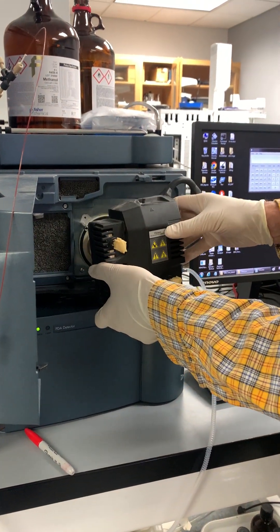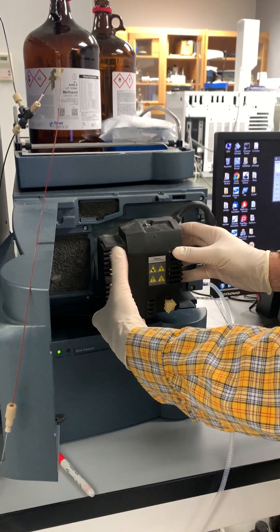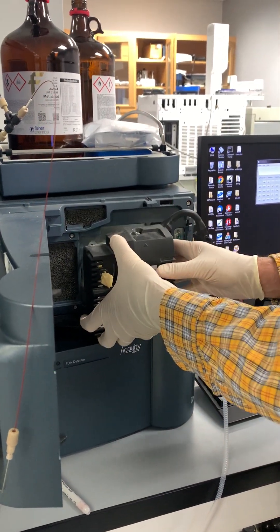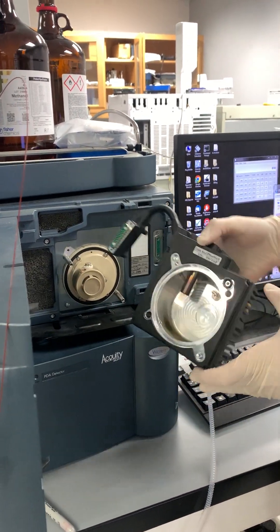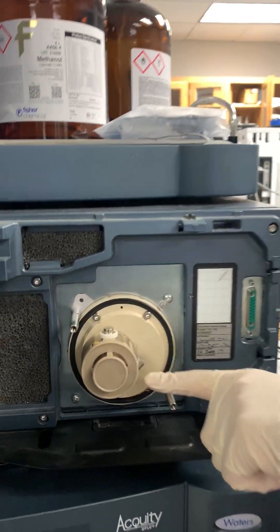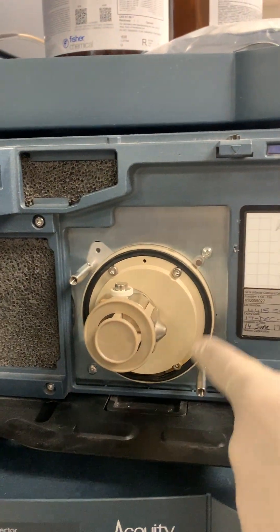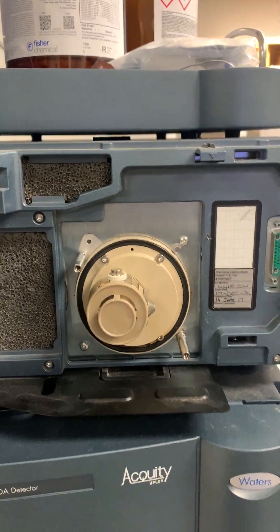We're going to clean the Waters QDA source enclosure. We've taken it off with these two wing nuts, unplugged it and pulled it off. You can see the inside is crazy dirty. We're also going to take the source cone off, clean that, and replace this o-ring with a fresh o-ring.